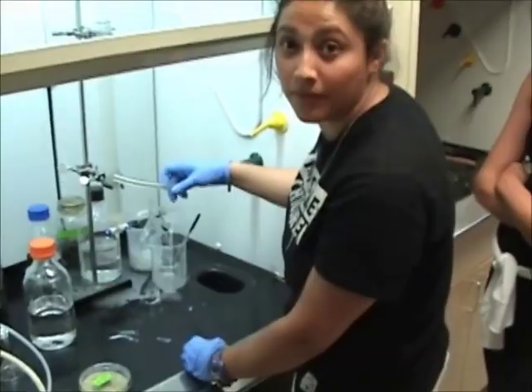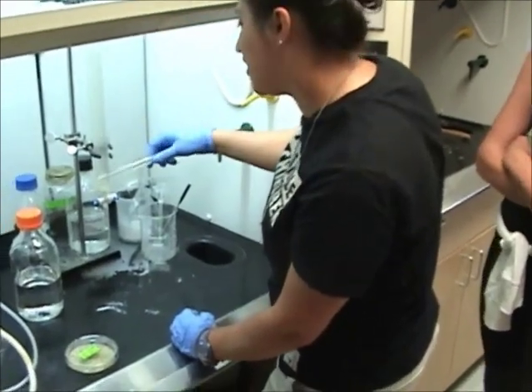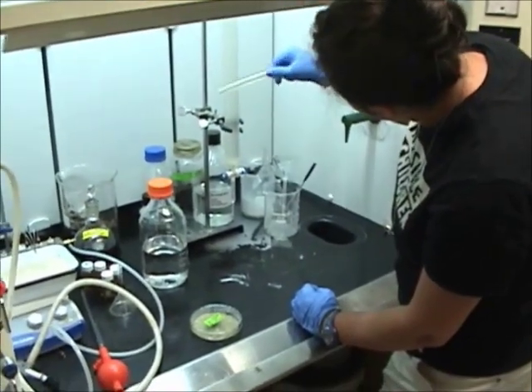This is an extraction experiment — it's the kind of thing you'd do in chemistry class. It's extracting. There's a specific name for that column: flash chromatography.